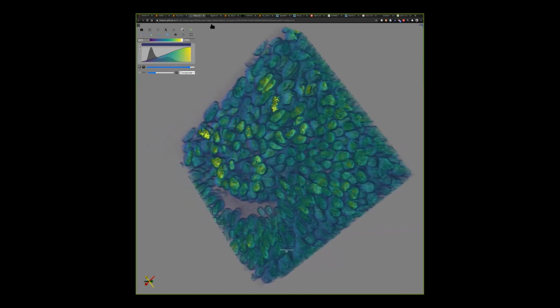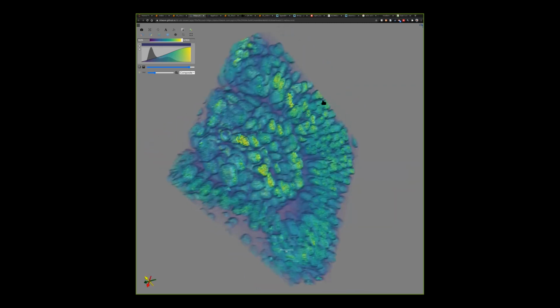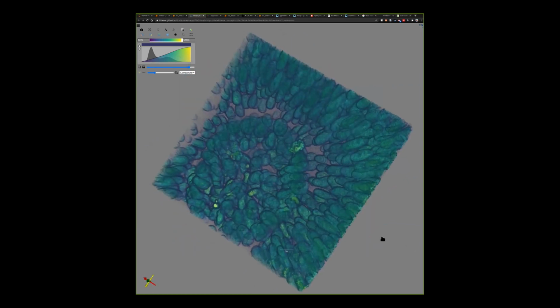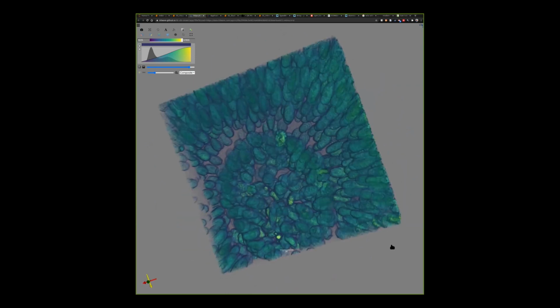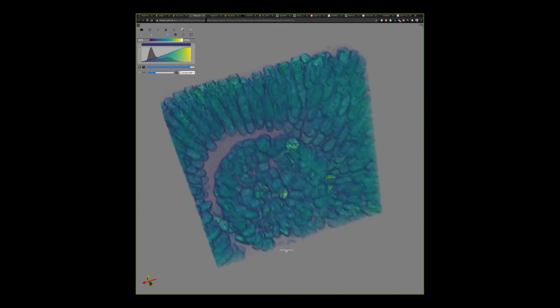So to use something like this, how do you store the data? And other than the example data, how do you get your data into it? It's a very good question. There are many paths, and the different paths have different capabilities. For this example, we're just providing a link to the data in the URL. So if you have any data set, like a PNG, and you put a link there, it's going to download that data and load it.